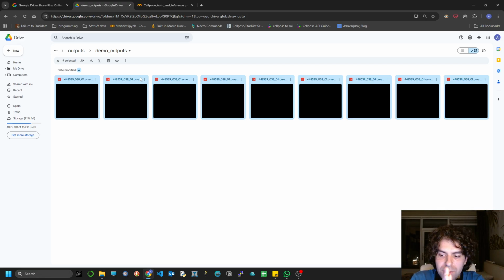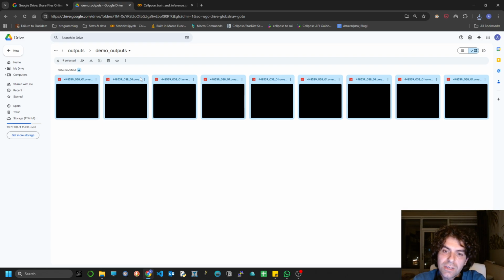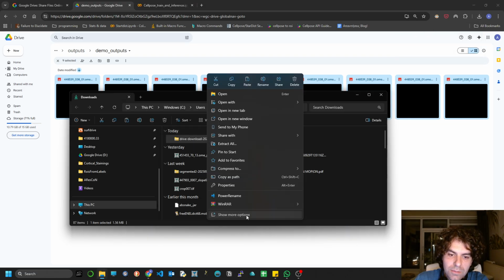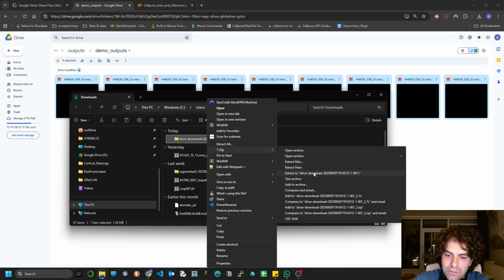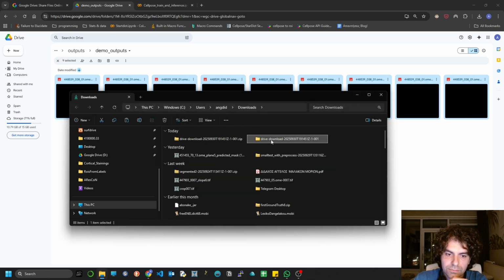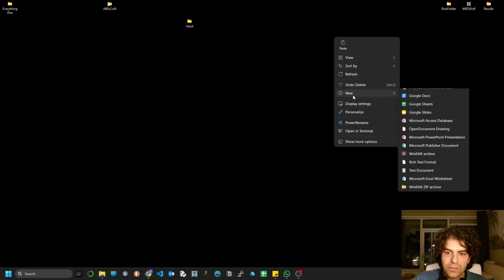The next step that we're going to perform after we download them is to create folders again, plane 1 rows, plane 2 rows, and so on and so forth, and we will just copy paste these images to their respective folders. Files are downloaded already, and I am going to extract them inside a folder. Let's use this folder temporarily. Let's paste it on our desktop.